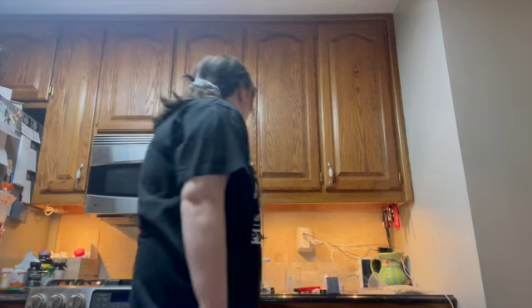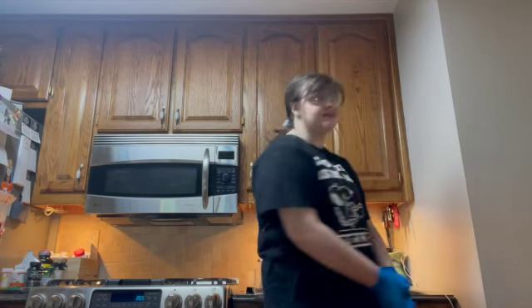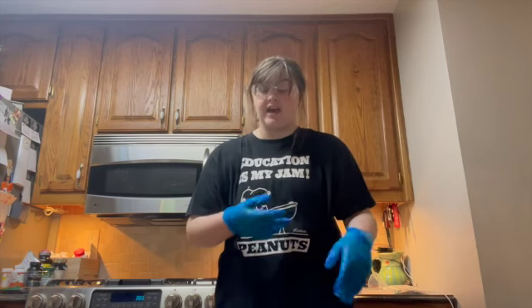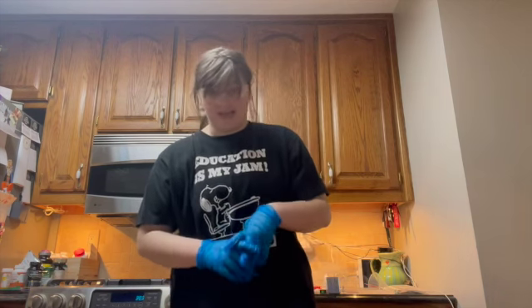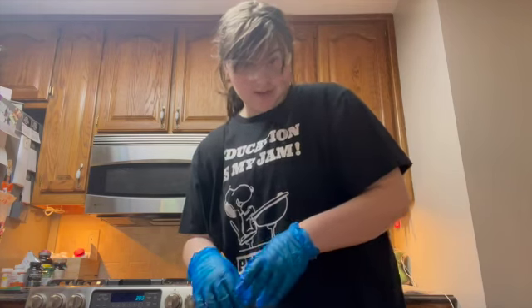Okay, so checking back in with our titration, I have titrated 16 milliliters, and the pH that was just checked for 16 milliliters came out to be 4.7 pH. So it's still going, but we'll see what happens in a little bit.